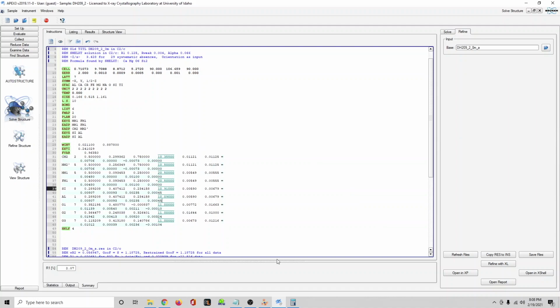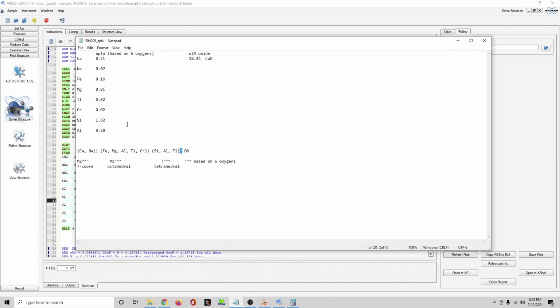But that doesn't account for all the aluminum, actually. So in here, 0.09 is, so 18 fills up the rest of it, which leaves 0.1 APFU. I think that's how the calculation works. Yes. So we have to put the rest of the aluminum in the M1 site, because aluminum also coordinates octahedrally. It's probably not going to be in the calcium site because aluminum bond lengths are much shorter. It's not going to be too happy there.